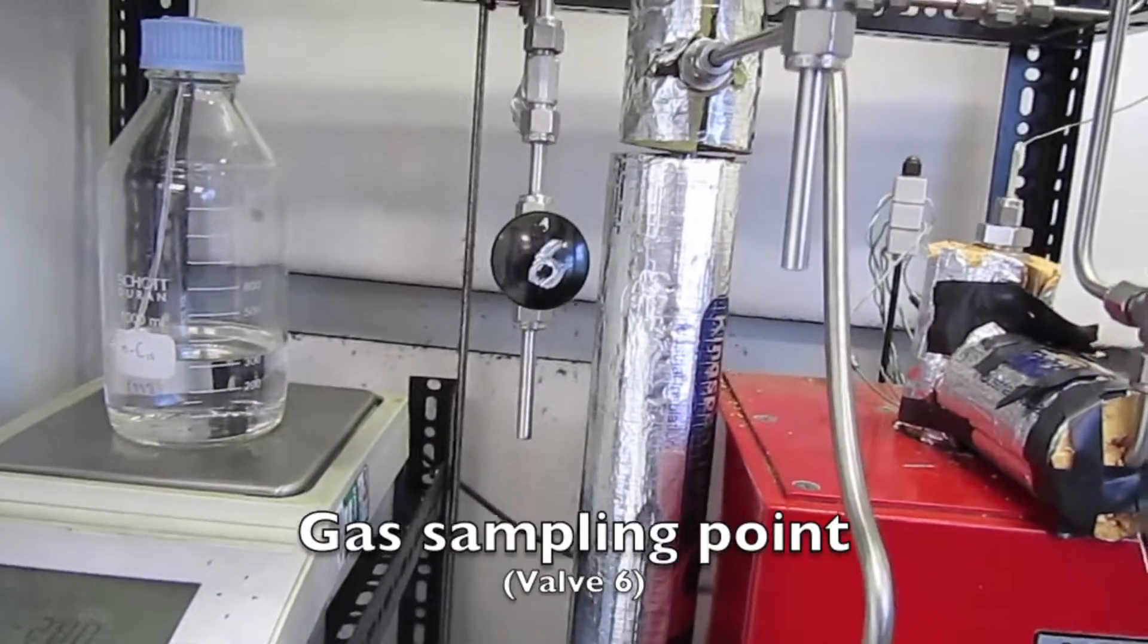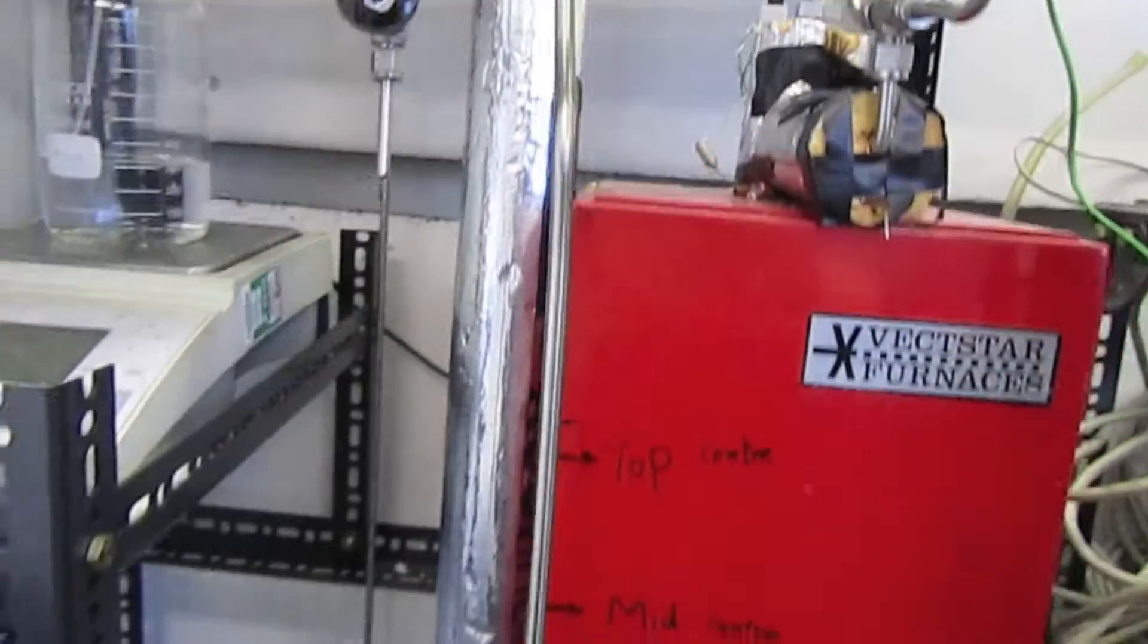This is important as the product is often partitioned between the gas and liquid phases.